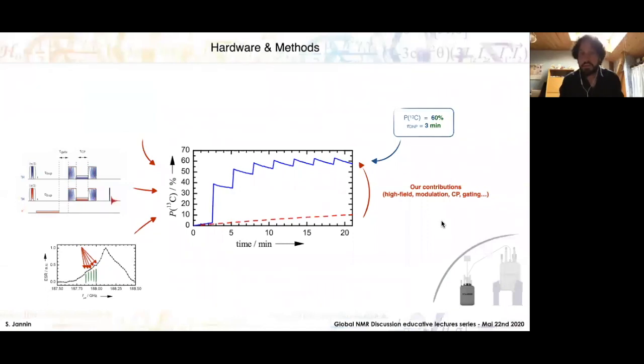And so this brings now DNP to almost the highest theoretical possible value, but also with a time which is actually almost too short. And you're not going to do an MRI experiment every 3 minutes, but it might be interesting for MR spectroscopy, because if you want to have high throughput and do an MR experiment often, then that might actually turn to be very useful.